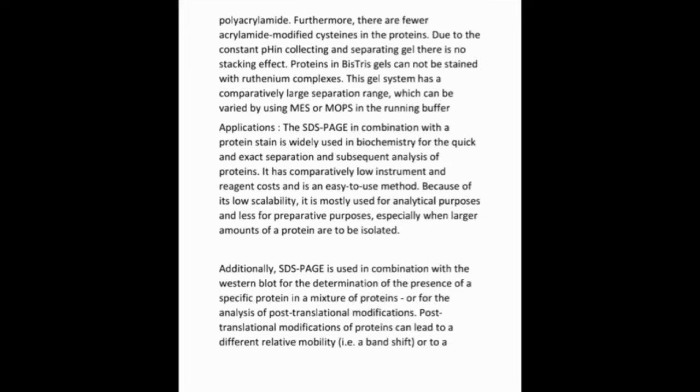Second, additionally, SDS-PAGE is used in combination with Western blot for the determination of the presence of specific protein in a mixture of proteins, or for the analysis of post-translational modifications. Post-translational modifications of protein can lead to a different relative mobility.